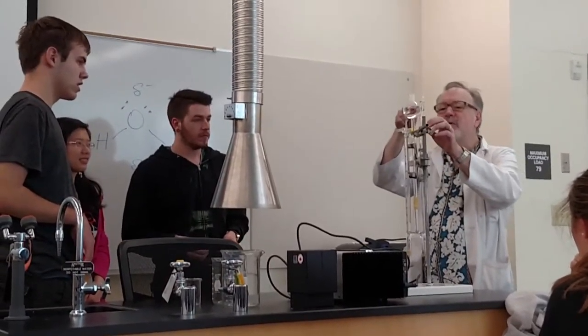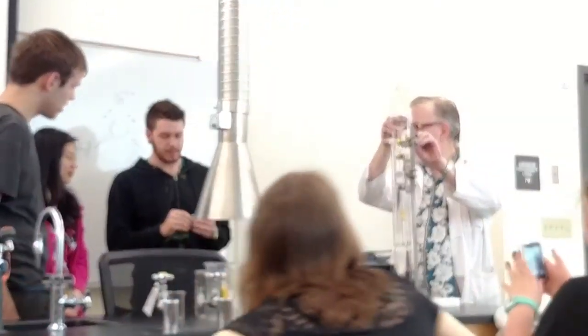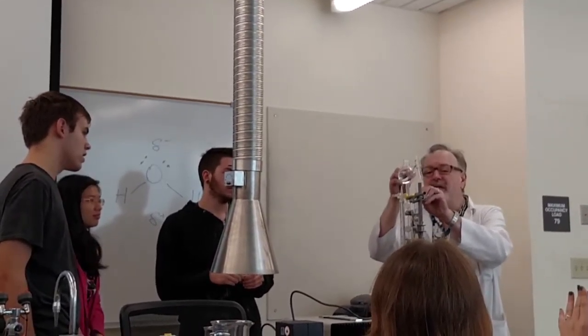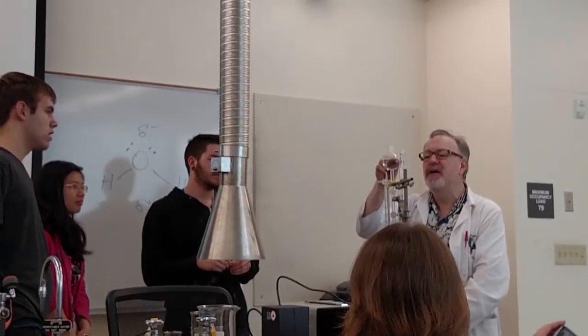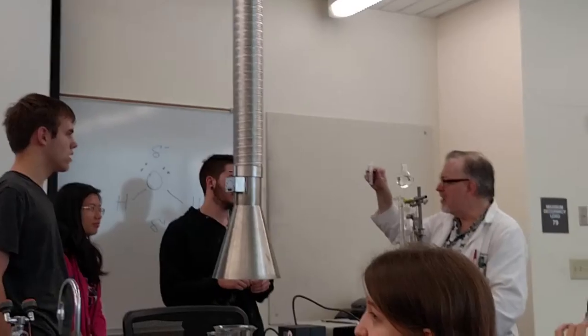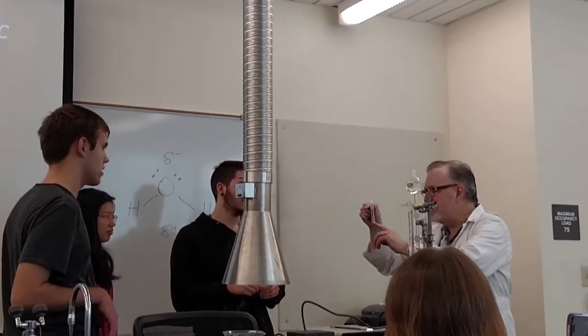You have a test tube and a test tube holder. Make sure to put it in the right place. I'm going to be filling this with the hydrogen. The hydrogen is less dense than air, so it's going to be collected in here like this because it's lighter than air. Then you put the match under it.